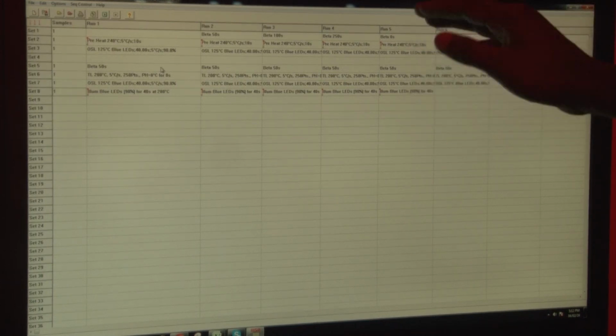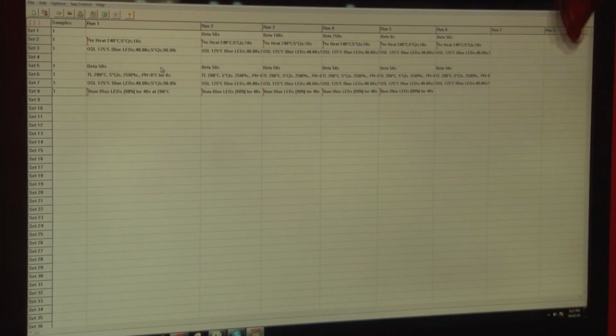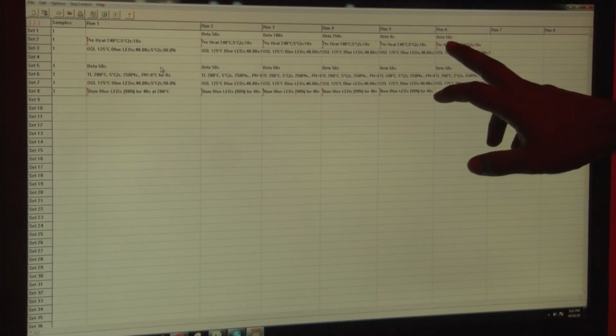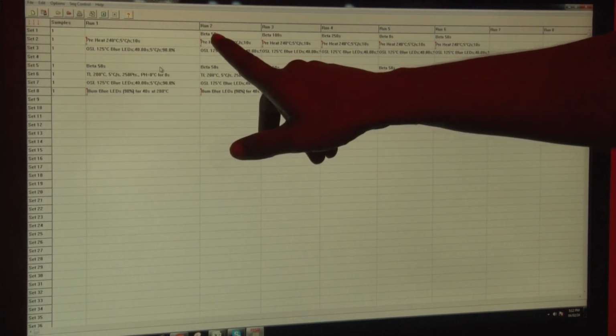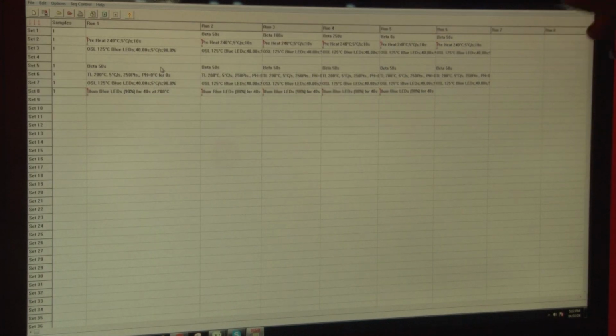If at all we are getting some signal on this run, that means the signals are coming from the temperature, not from the light source. And then in the last run we are giving the similar dose which we applied in the second run. This similar dose we are using to check the recycling test.